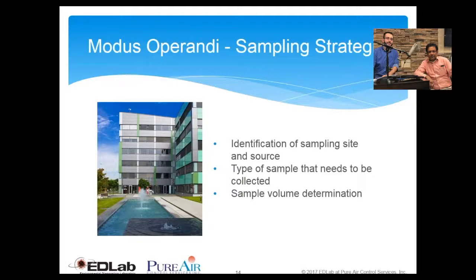Okay. Is there anything else you can do to make sure you're prepared for sample collecting? Yes, definitely. Without making a strategy, the sample collection is not going to run smoothly, because you will run into a lot of hiccups. To avoid those hiccups, if it is possible, try to procure a map or other graphics and identify the sampling site as well as the source, whether you are going to collect a specimen from the cooling tower, from a faucet, from the second floor, first floor, or ground floor of the building.